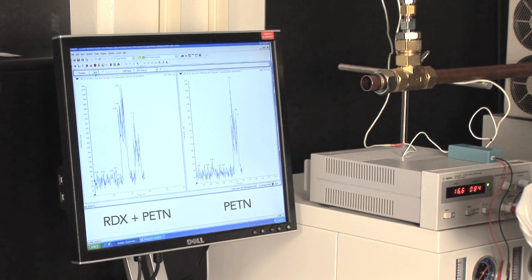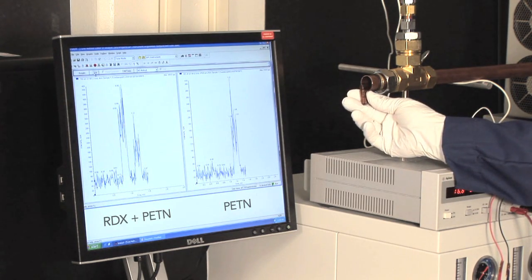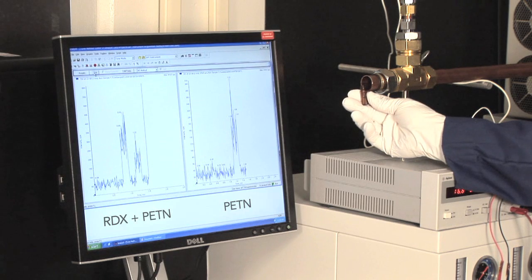C4 is a plastic explosive that contains predominantly RDX, and this is a vial containing C4. You can see the RDX response coming off of the C4 out of this vial.